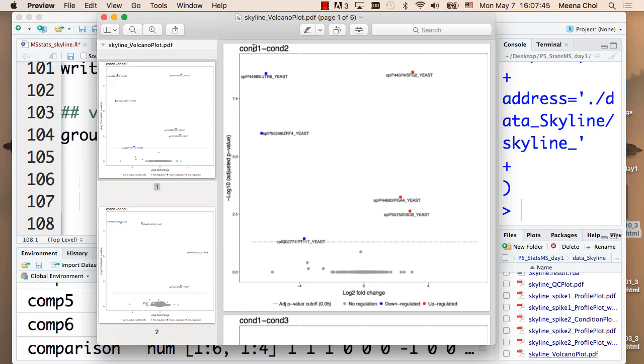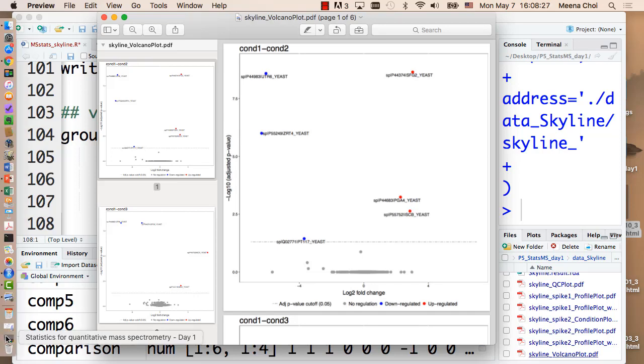And then there are 2 types of the color. Red is upregulated, blue is downregulated. And then here, we just name it. You can change the font size for letter. You can change the font size of the dot. You can remove this protein name if there are too many proteins around here. You can completely remove it. You can change the size and so on. So here 1, 2, 3, 4, 5, 6 proteins for the specific comparison, right? Let's double check this is the correct ID, what we expected.